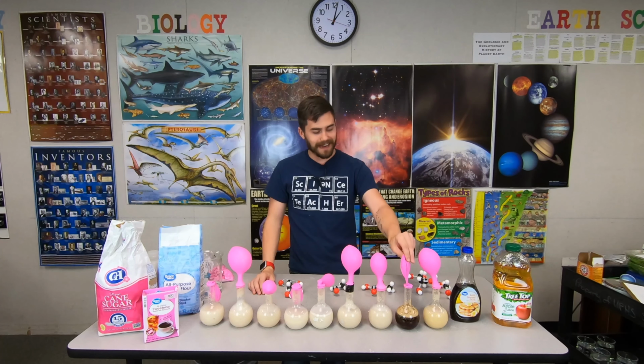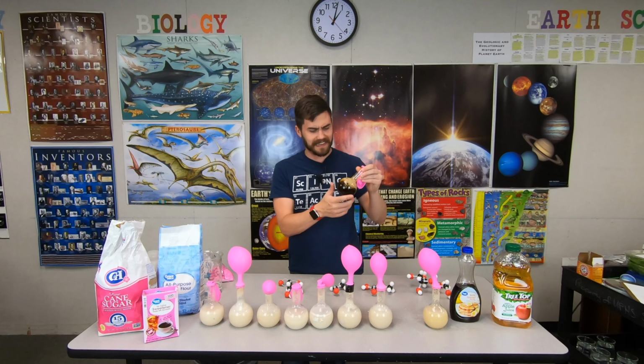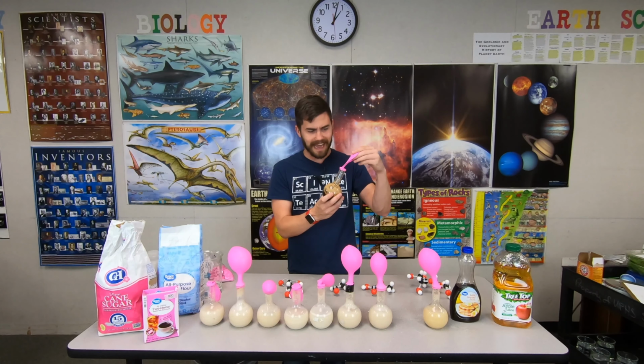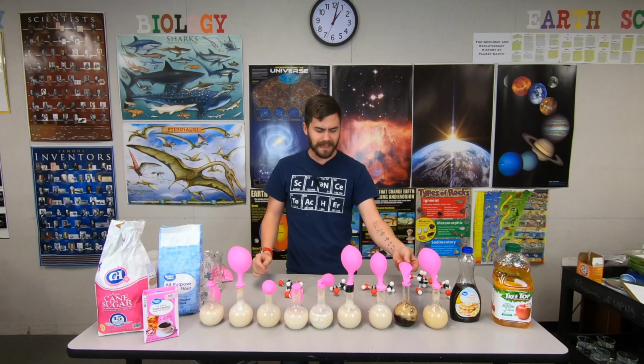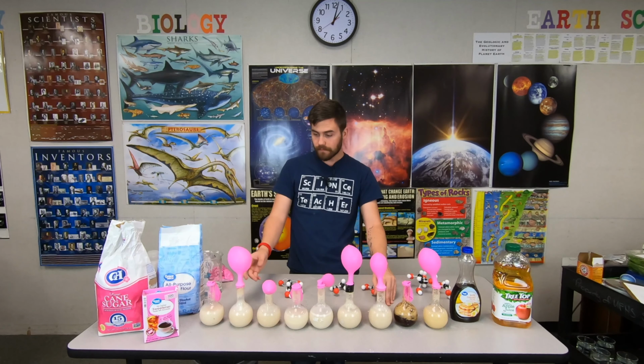Oh, I forgot about the syrup. I had never done this before. I really thought that this yeast would be able to break down the syrup, but for whatever reason, it simply can't. There's really nothing going on in there. It could be that my yeast are dead. Who knows? The syrup may have killed them.